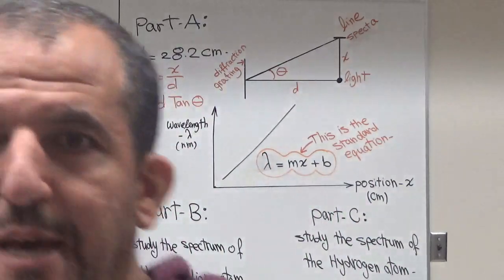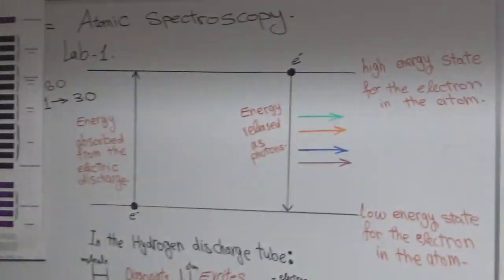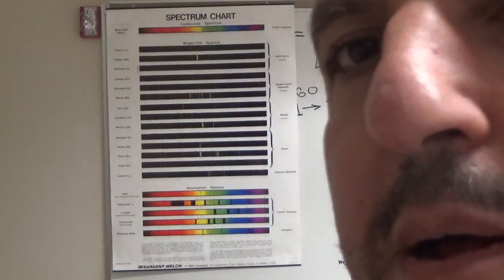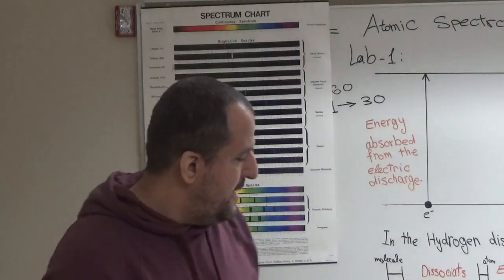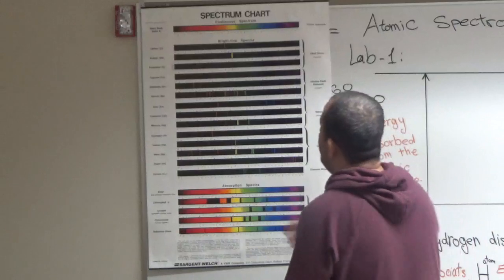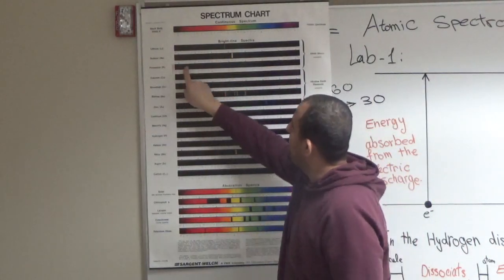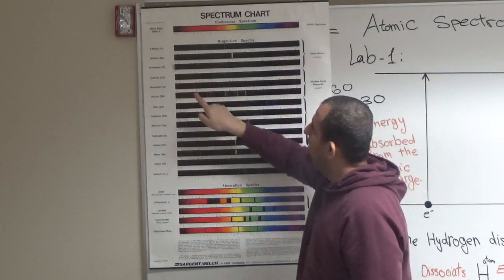And I will show you that here, so maybe I need to move a little bit right here so you can see that clearly. Okay, so you can see here, for example, the spectrum from lithium, the spectrum from potassium, the spectrum from sodium.